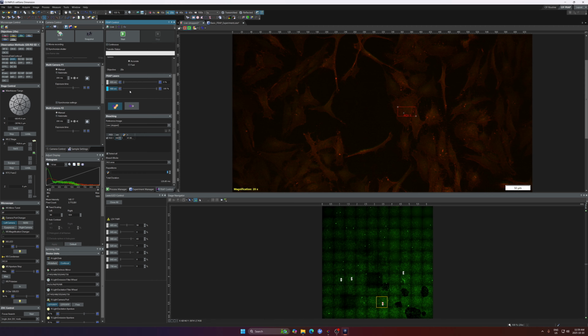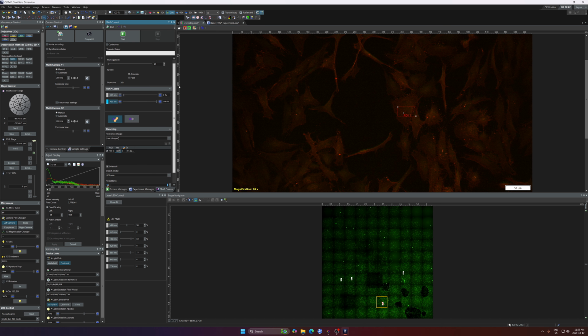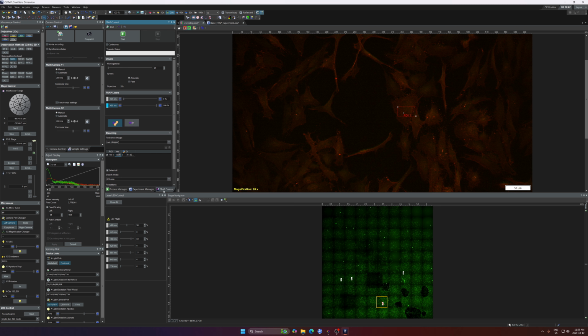The second one, of course, is your laser intensity. Usually for this 488, you will use the maximum power. The third one is actually in the FRAP module, called homogeneity. I can never pronounce that. Normally I would leave it at the lowest value. That's the highest intensity laser power, but it spends the most time to bleach. If you do a FRAP experiment, you need really fast bleaching, so you might want to increase this to reduce that number.